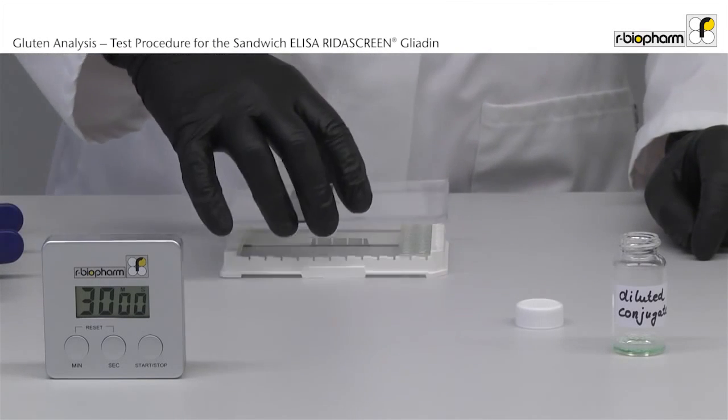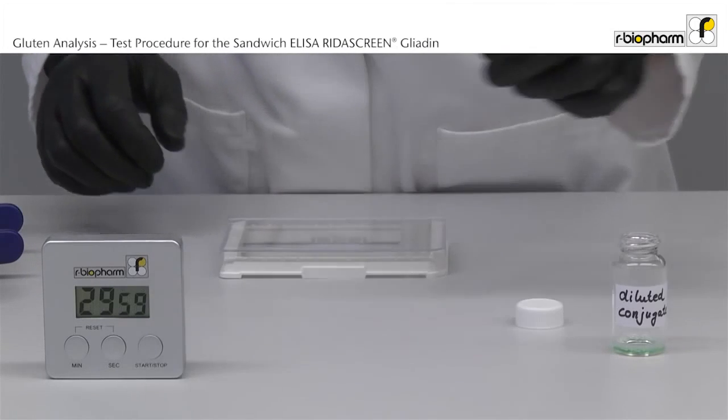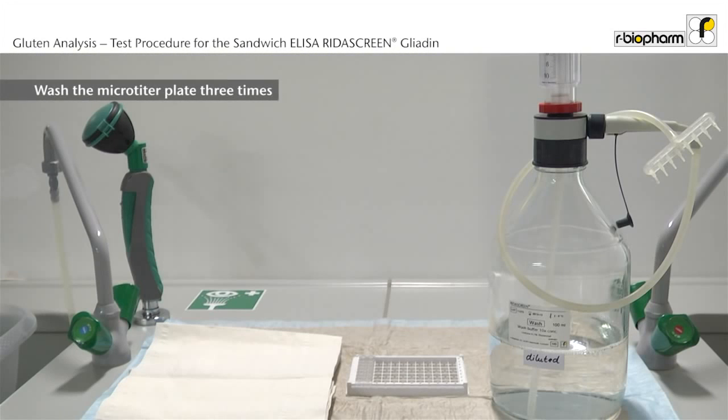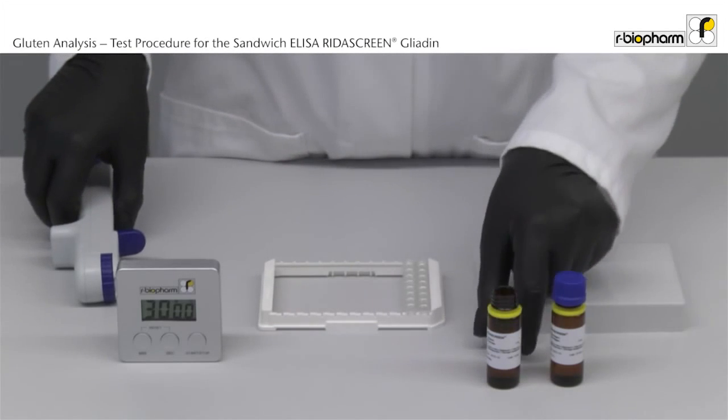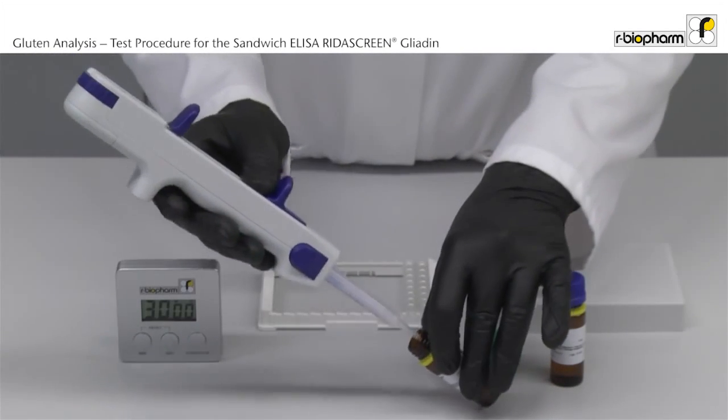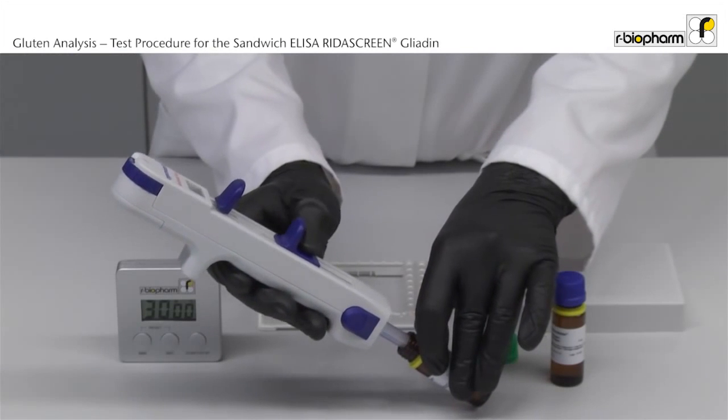Incubate for 30 minutes at room temperature. Put a lid on the plate. After the incubation the plate is washed 3 times. After washing, add 50 microliter of substrate and 50 microliter of chromogen solution to each well with the multi-stepper.